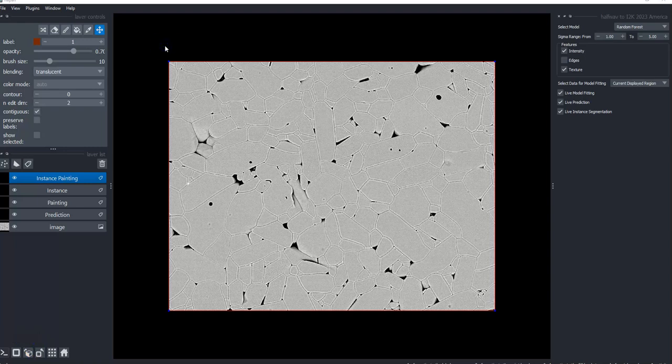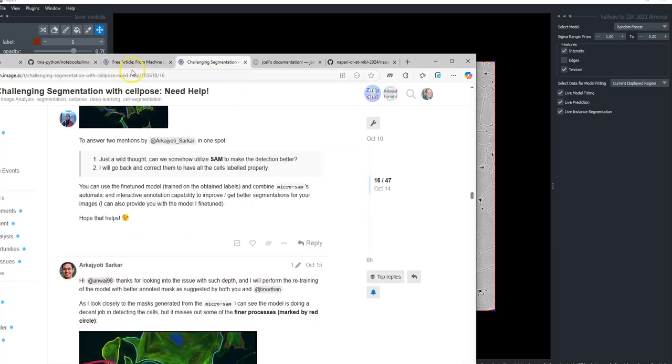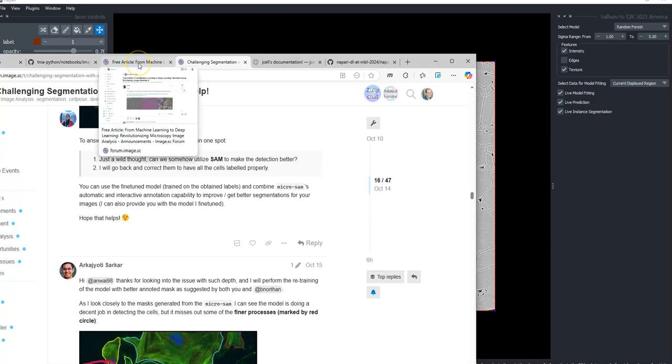Hey, this video is going to be about machine learning. In particular, we're going to look at a couple of recent ImageSC questions. This first one is about an article, from machine learning to deep learning. And the second one is on this challenging segmentation problem, which has been out there for a couple of months now.